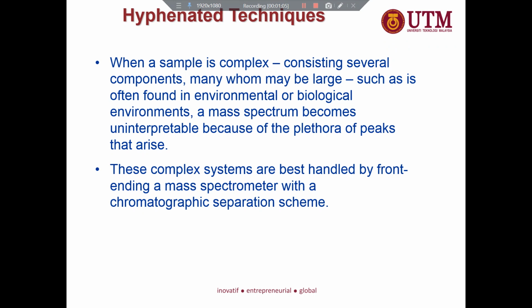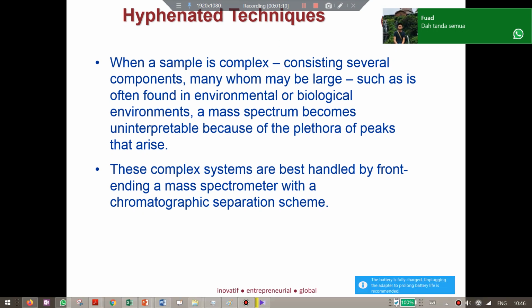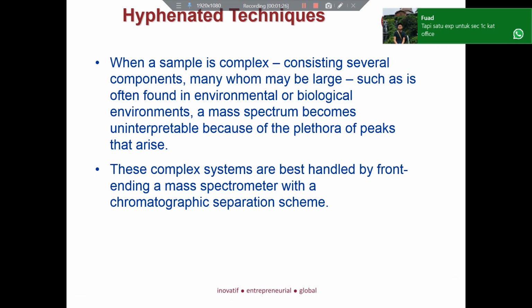Either you combine with the MS, the most common one, of course. What is best about MS is that you can always look into the spectrum, and you can always look to the library, so you can confirm. And if the problem still exists with that, you can combine with another MS, so you can obtain very unique identifiers.